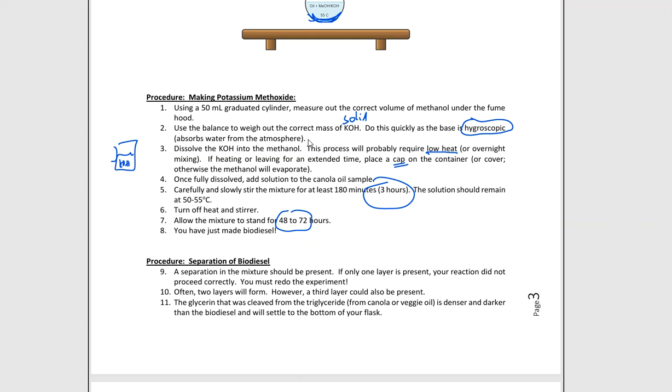So normally what happens here is that I do lift it up out of the water bath in case someone else needs to use the water bath. So I will lift it up out of the water bath for you. It's probably going to be on a clamp. It's not a big deal. And I will clamp your sample on the rack or on a ring stand that is located near the water bath. So your name's going to be on it. It can sit there for another 48 to 72 hours.